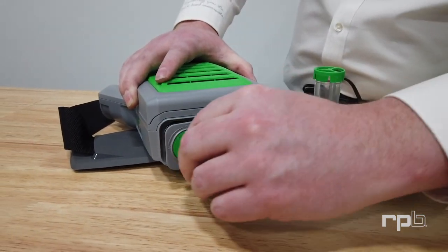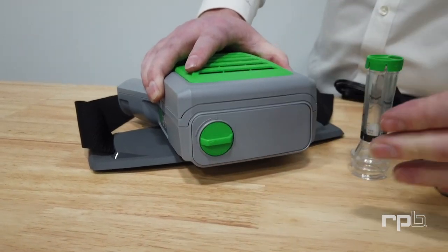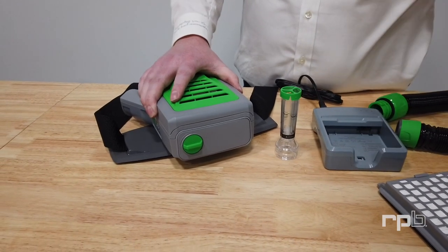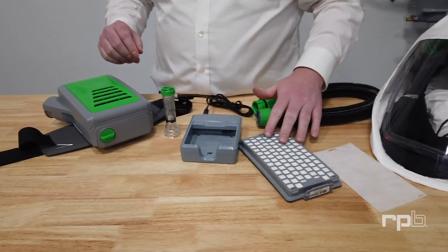When you close that door back, you want to ensure that it's locked in position so that the battery is sealed and out of the way of any potential damage from moisture or contaminants. Then you want to install your main HEPA filter.